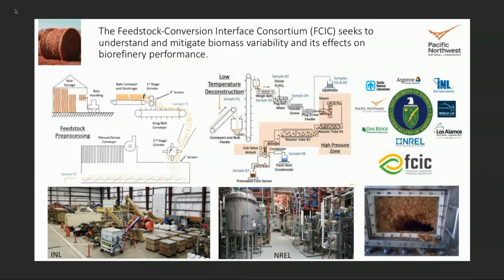What we're looking at here is a schematic of feedstock processing, with two different process development units, one at Idaho National Lab and one at National Renewable Energy Lab, for taking bales of corn stover, grinding it up, and then making a flour that goes into super sacks. It goes off to the National Renewable Energy Lab, where it's further chemically and thermally pre-treated. In some cases, they have a new process that's all mechanical treatment, which is very exciting, and then it goes into bioreactors for making fuels. But you can have problems where the biomass gets stuck and plugs up, so it's a very challenging problem.